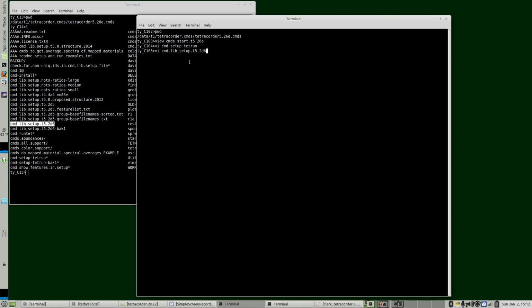If you make major changes, then we increment the letter here and go to E. So it'd go 5.2 D7, then a major change, 5.2 E1, and so on. During the course here, we will make changes and increment this. But in this session, I'm just going to describe characteristics of the expert system.